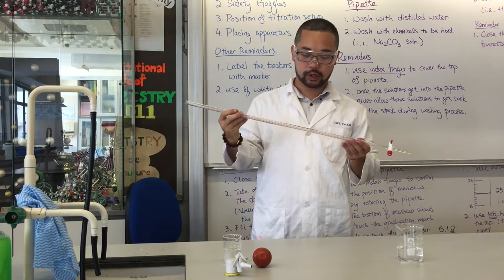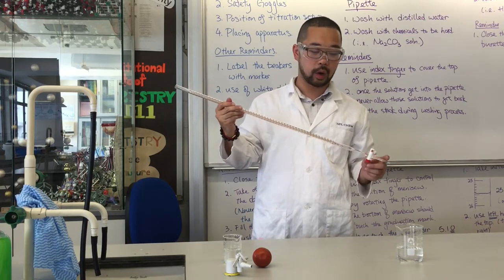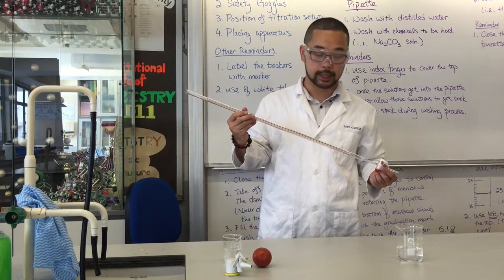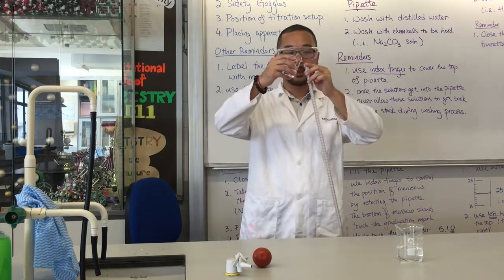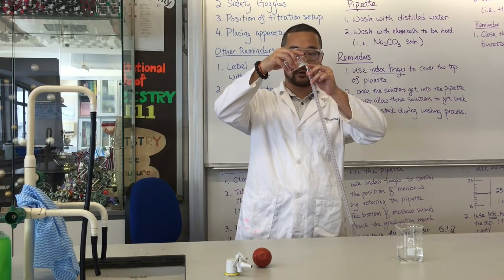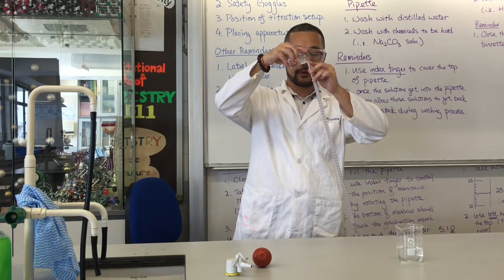For us to memorize, remember we'll use DI water to rinse it first, and afterward we're going to use the chemical to be used. This time we're using nitric acid. So make sure the tap is closed right now. We use water to fill it up. Like the pipette, we're going to fill half of the burette.